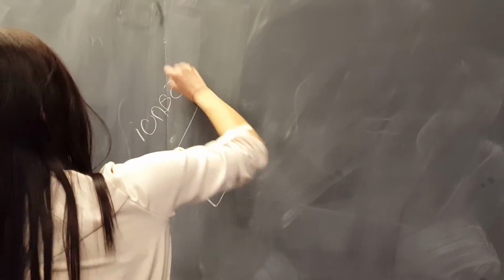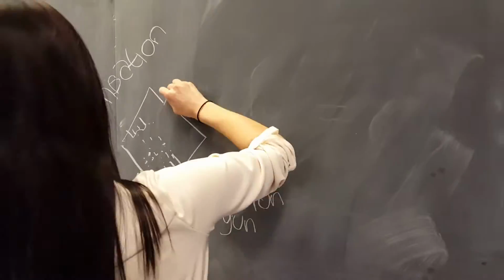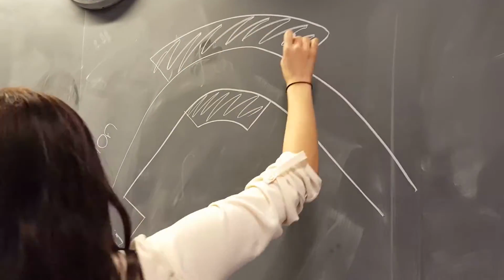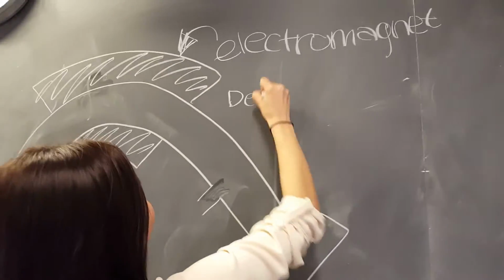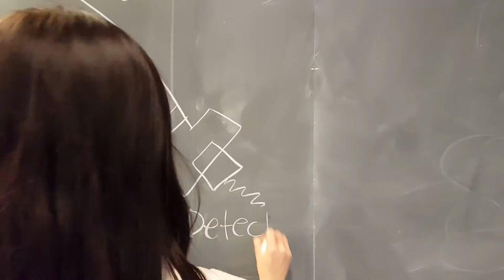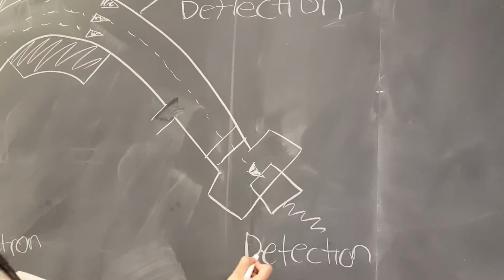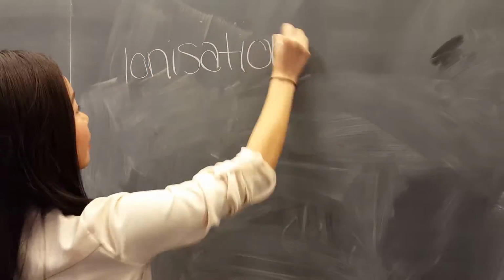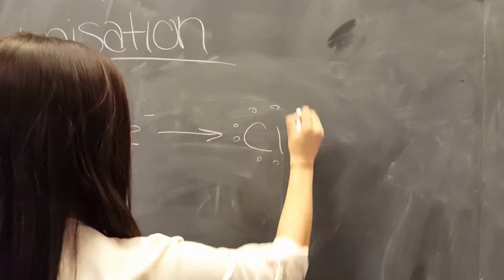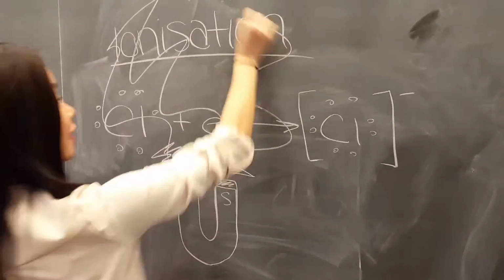There are several kinds of mass spectrometry that have pros and cons. Gas chromatography mass spectrometry is powerful, but the substance must be volatile. Liquid chromatography mass spectrometry does not need the substance to be volatile, but does not give information about the substance's molecular structure. Ions are charged particles that are created by causing an imbalance between the number of protons and electrons.